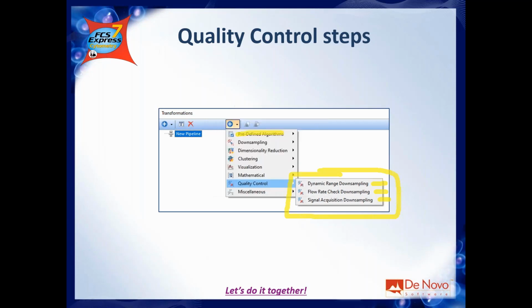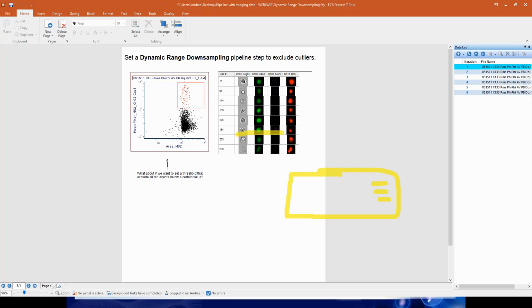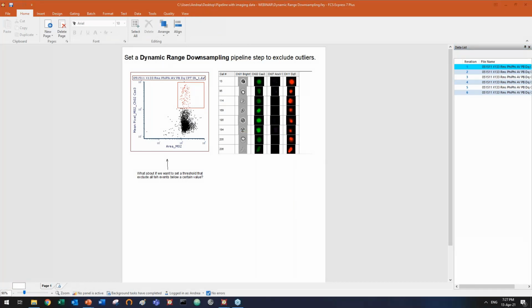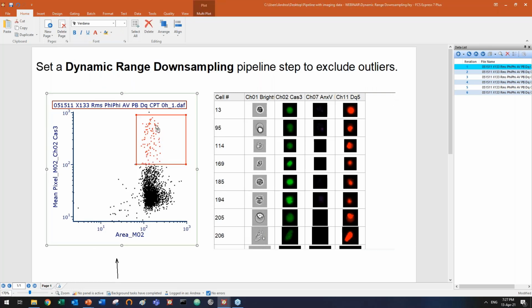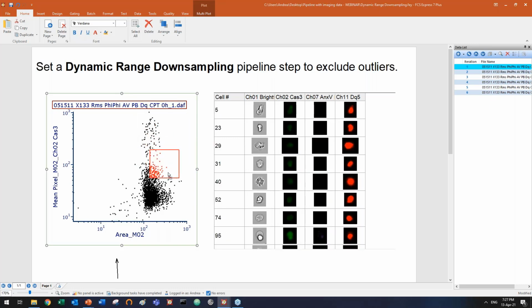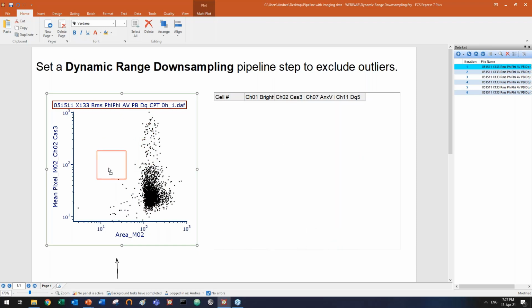In my layout, here we go. It's opening on my second screen. No worry, here we go. Okay, it's this one. Too many things. In this example, you see I have my plot of interest. It's a very basic layout. I just have one plot, one gate, and a few cells, just to show you that these come from ImageStream. I can apply gates. I can move my gates. My single cell table here at the right is updating live. So I can also gate on one single cell here.